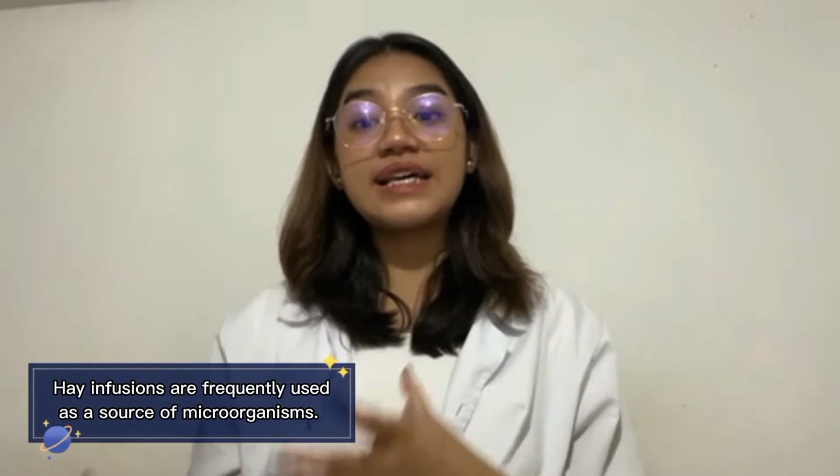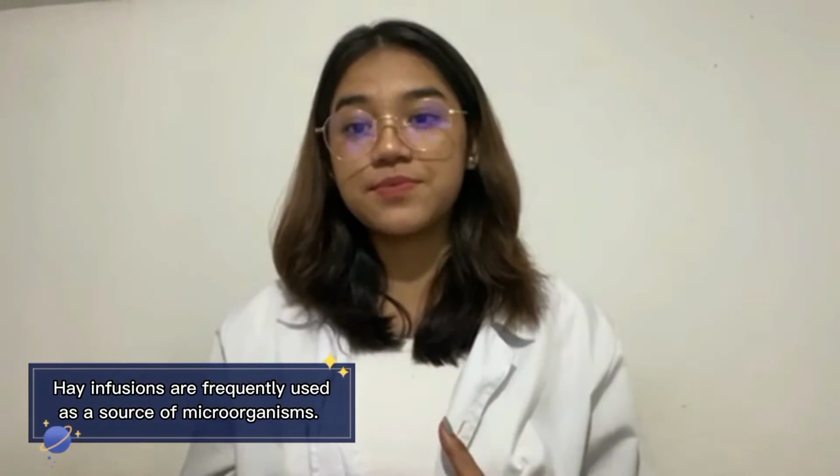So what exactly is hay infusion? For the purpose of researching decomposition, fermentation, and disease, hay infusion is frequently used as a source of microorganisms. Students will be able to watch various species and the variation in their population while an ecological succession occurs in a hay infusion.